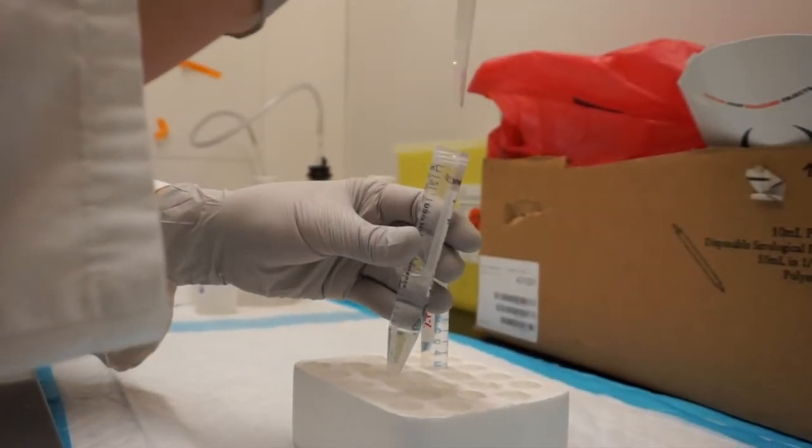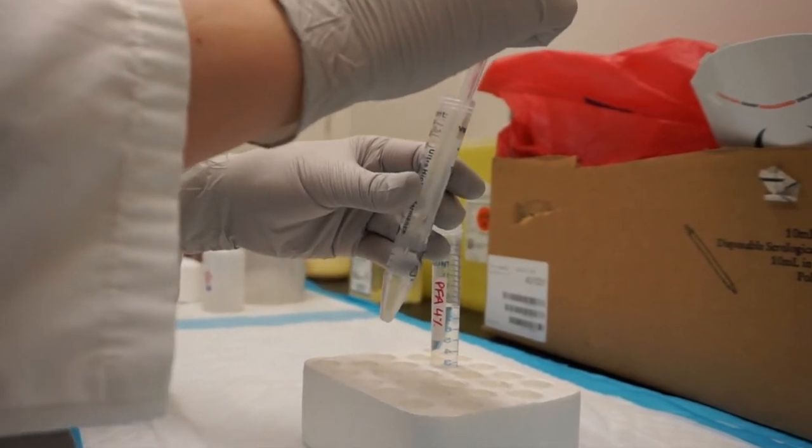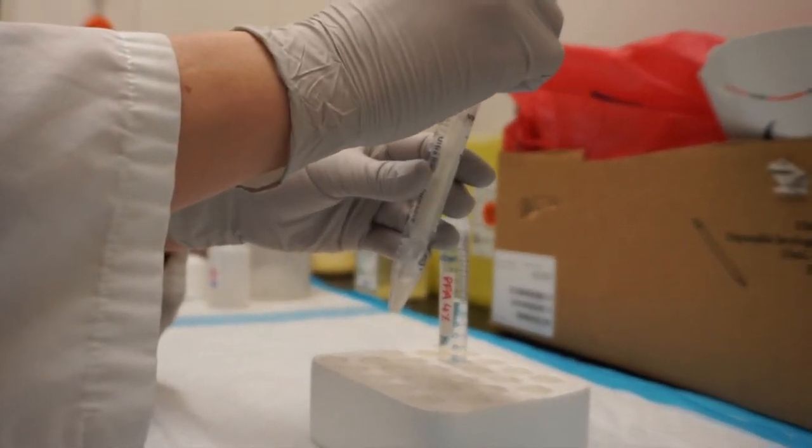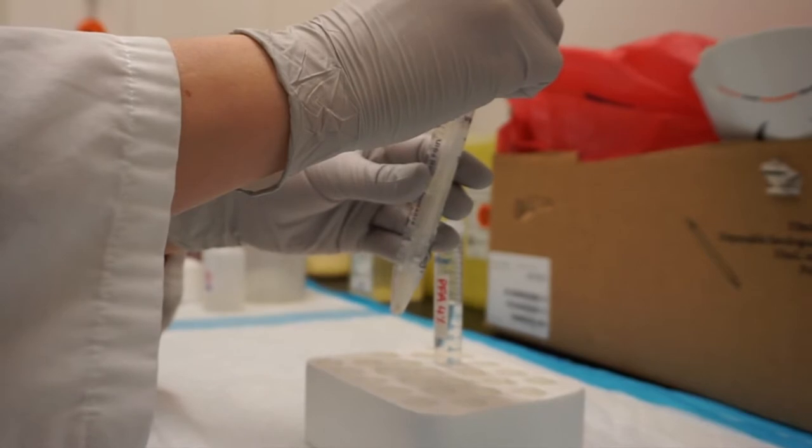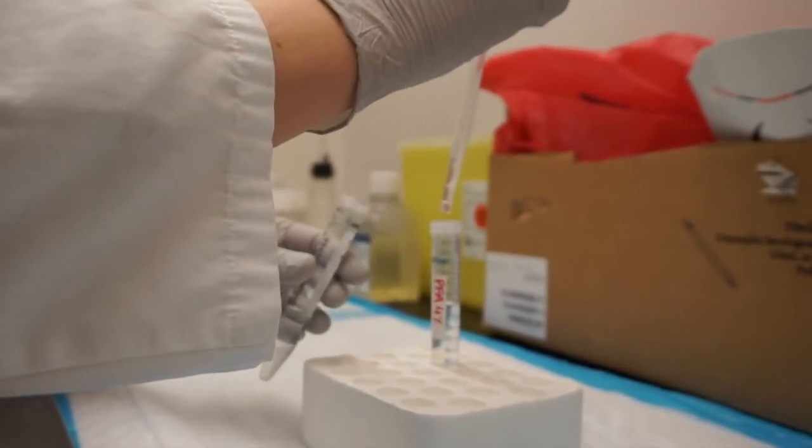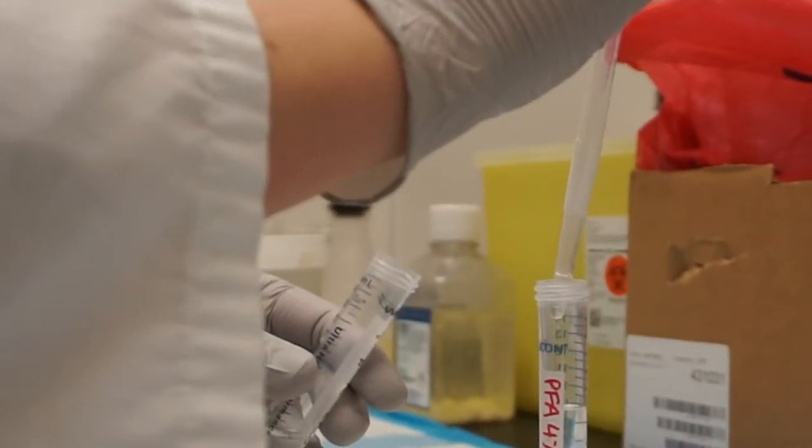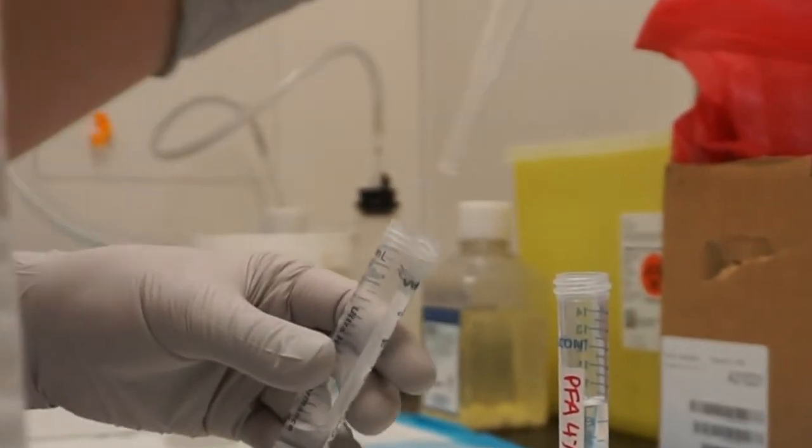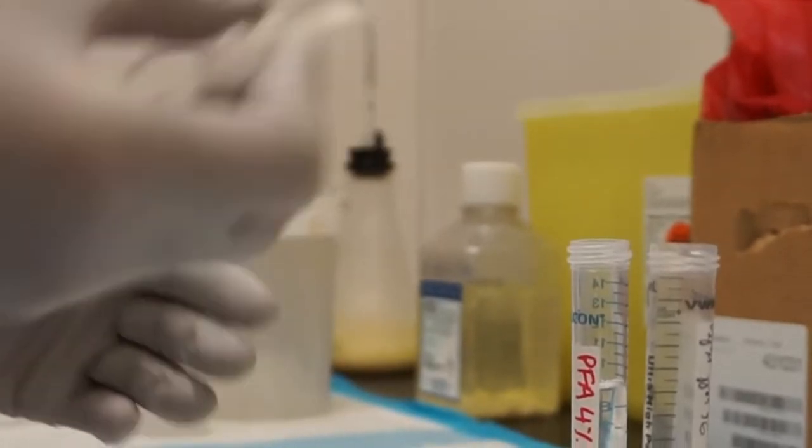After having collected your organoids and washed them with PBS, transfer them to a tube containing a solution of 4% paraformaldehyde using a wide bore pipette. This should be done under a chemical hood. Organoids can be incubated for one hour at room temperature or overnight at 4 degrees Celsius.